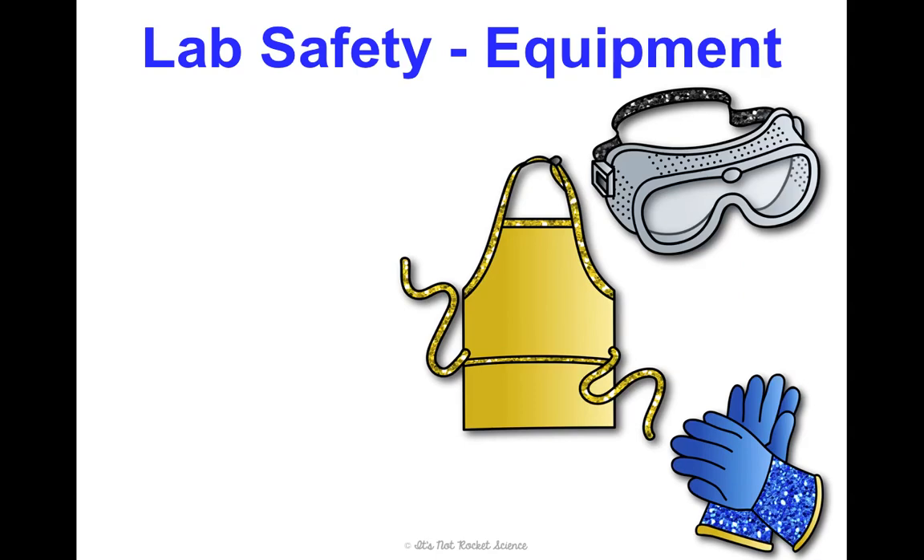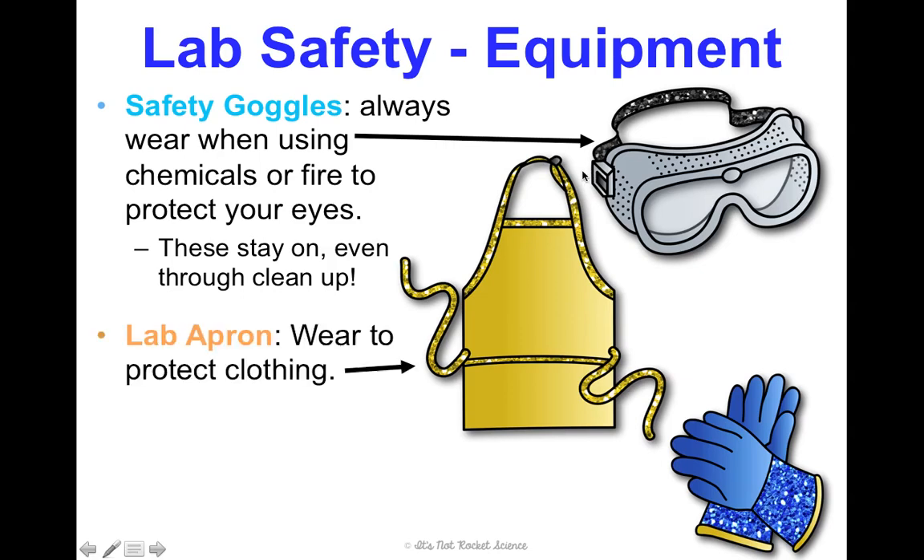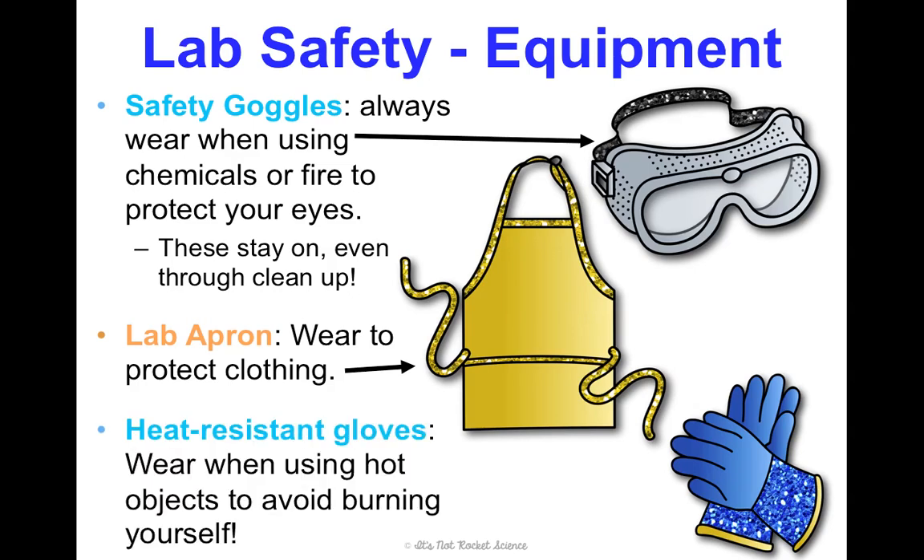Some equipment that's going to help us be safe: safety goggles — you're going to wear these when we're using chemicals or fire, and you're going to keep them on until we're entirely done cleaning up. That's really important. Even if you wear glasses, you still need to wear goggles because they have nice all-around protection. A lab apron you'll wear to protect your clothing from any spills, and heat-resistant gloves — essentially oven mitts — to avoid burning yourself when working with hot materials.